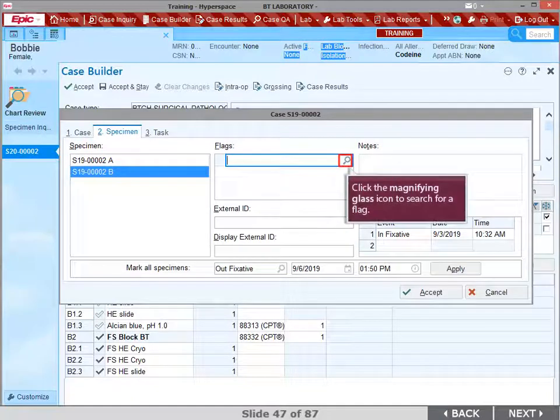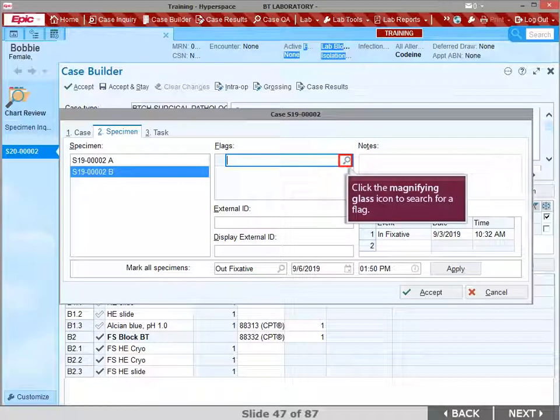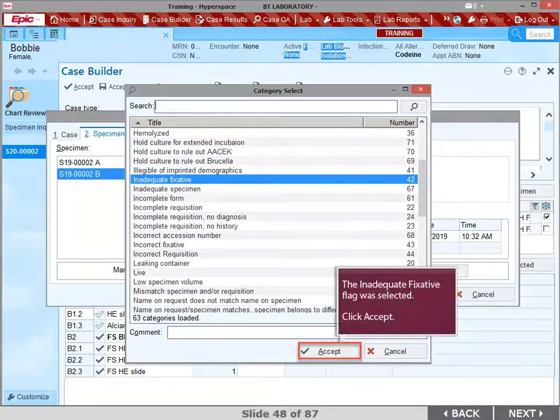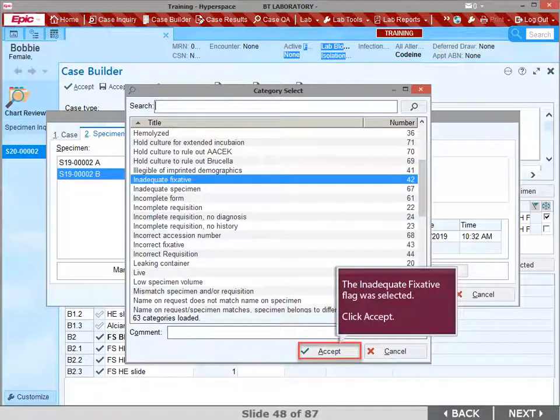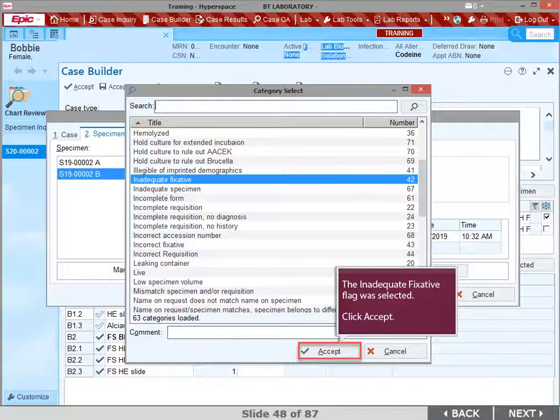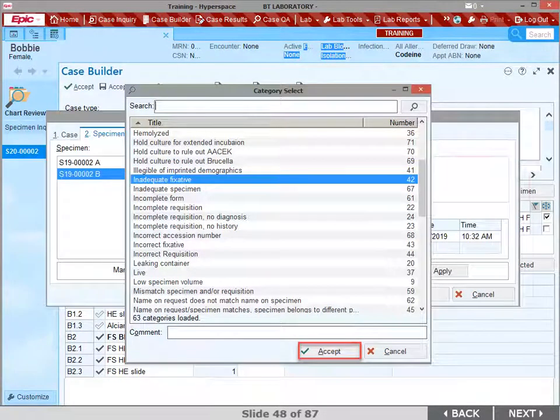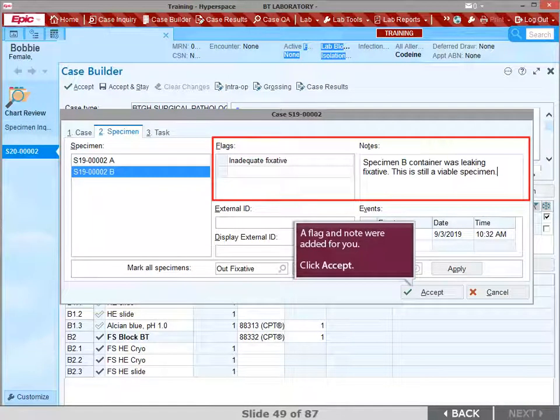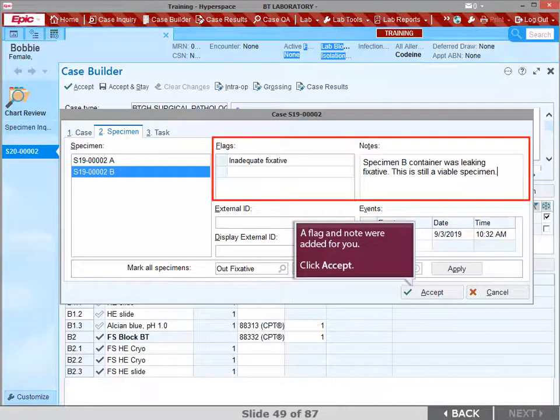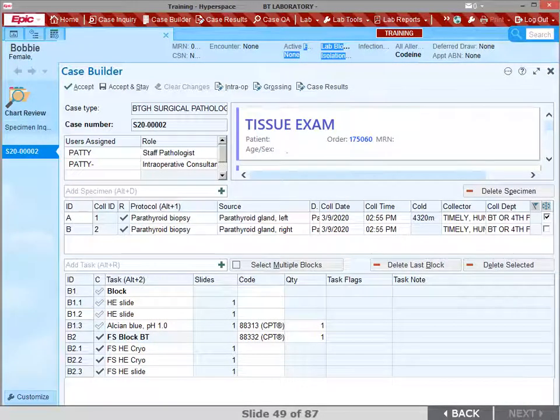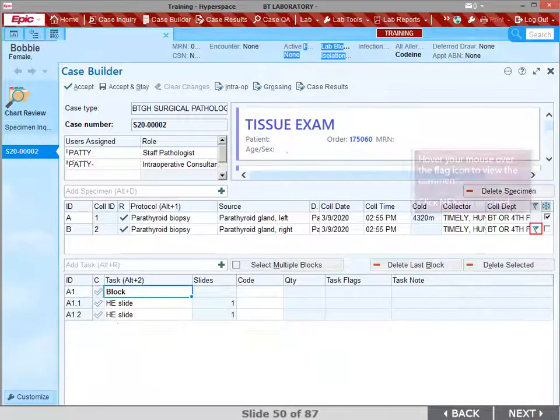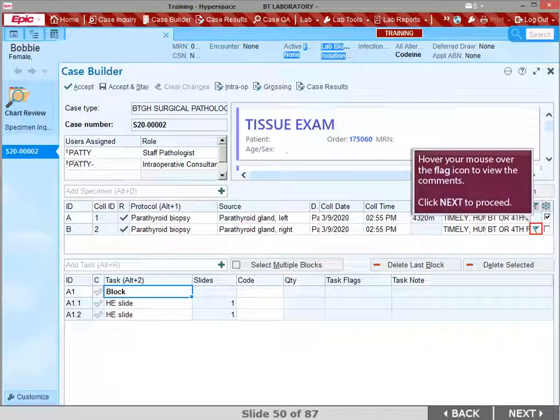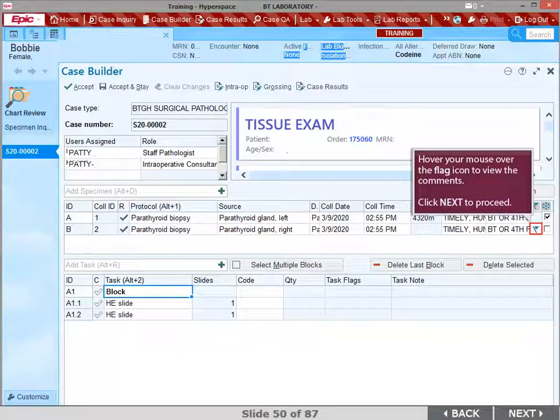Click the magnifying glass icon to search for a flag. For this example, we selected the inadequate fixative flag. Click Accept. A flag and note were added for you. Click Accept. You can hover your mouse over the flag icon to view the comments. Click Next when you are ready to proceed.